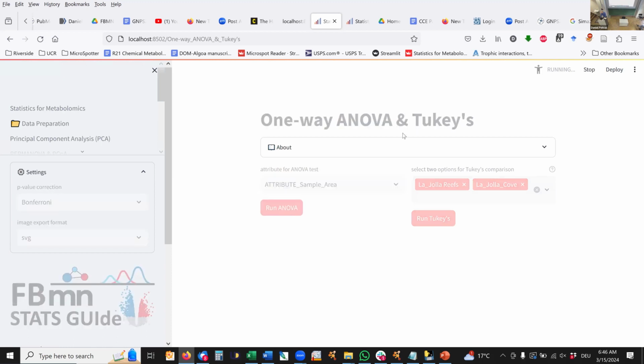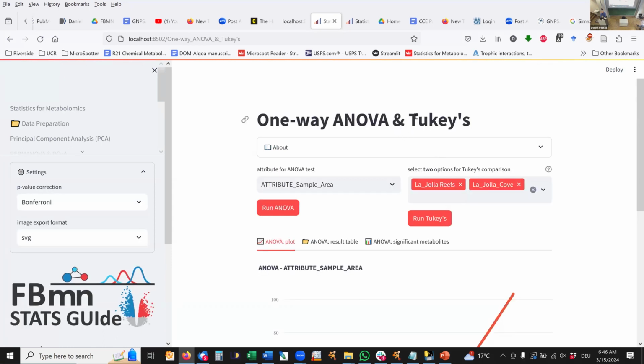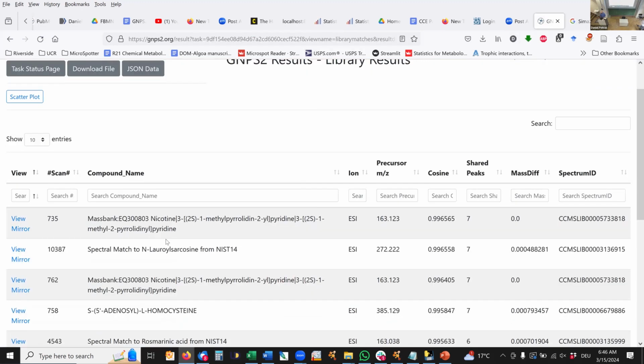Anyway, while this reruns, this would be one purely data-driven way to look at it, right? But I mentioned already to you that from my memory, I also had some other compounds in mind that I thought would be interesting. Now, obviously, we worked a lot with this data, so I looked at it a couple of times. But if that would be a brand new data set, then literally the first thing that I normally do is I browse through this list of annotations at the beginning. Because as a chemist, I really want to know what molecules are in there, right?